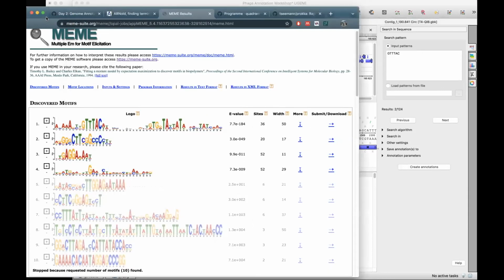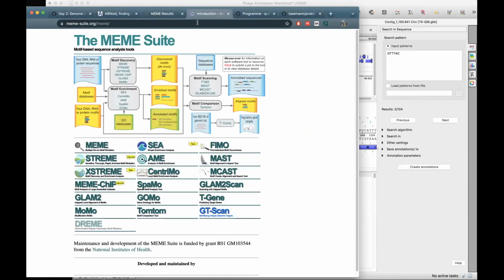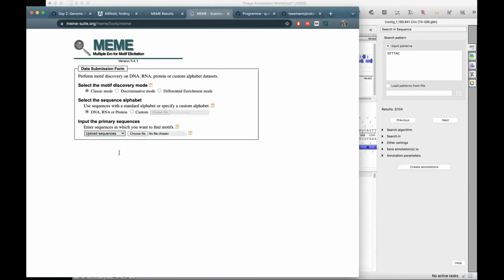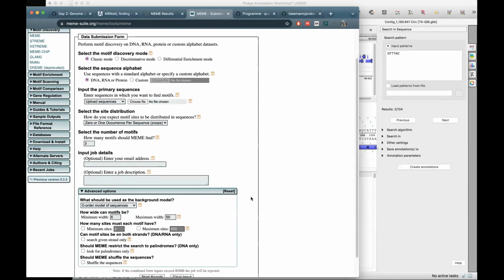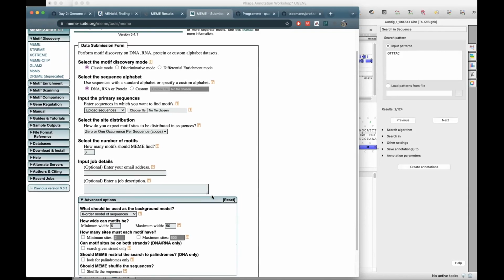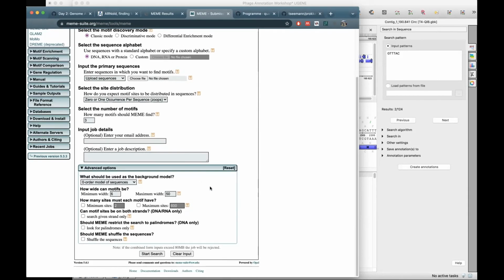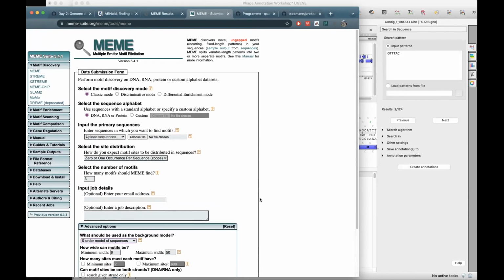We can have a look at the settings again if we open it again, because we ignored the advanced options. Oh no, you can't choose the mismatches. No. Okay, so if you use this method, it will be difficult to do the two nucleotide mismatch rule.